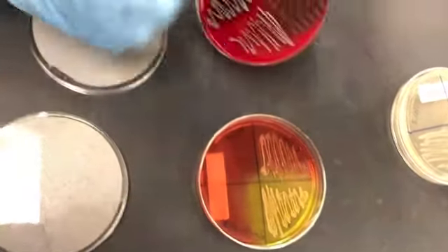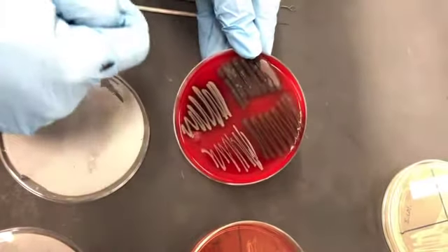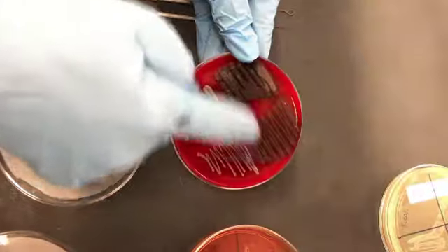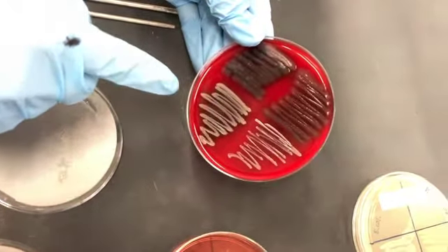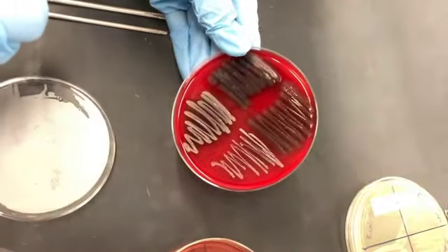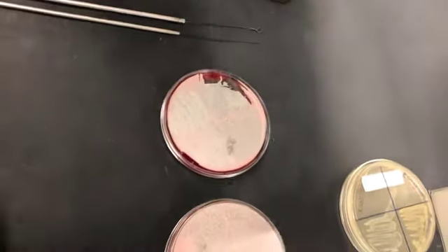Over here, we can see that in the hemolysin plate, the red blood cell plate, sometimes the background is gray. And if we put this under a light box, you would see sometimes we can see clearing, which is going to be important in determining what the role of the bacteria is.